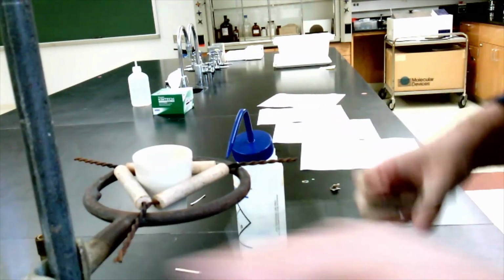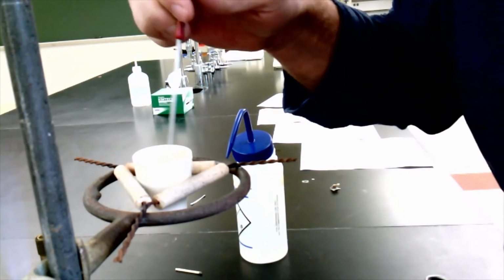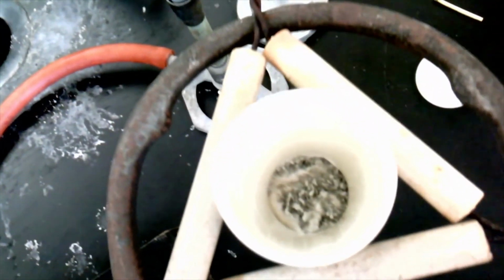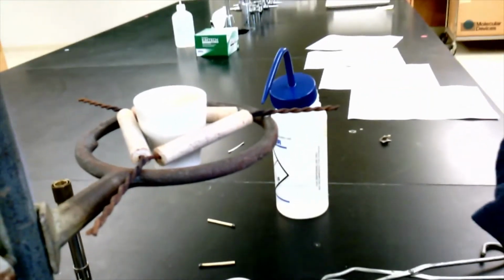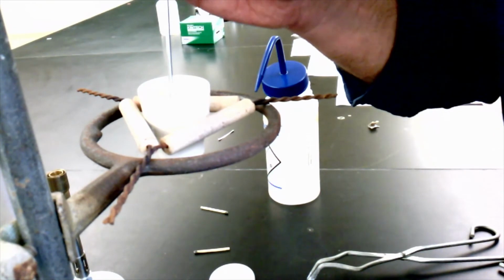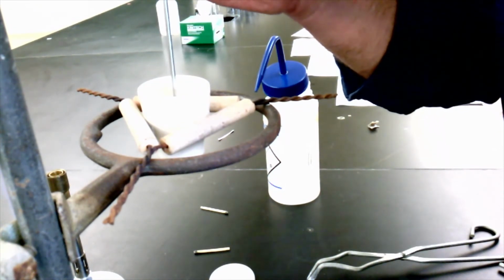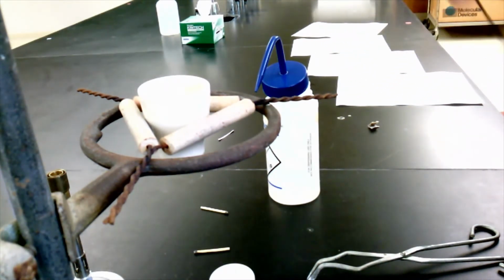Let me try to show you what the contents look like at this point so you can have an observation for that. Basically, what we got is a bunch of gray and white powder. Okay, there's no shiny metal pieces left. It's all just sort of gray and white powder. It may not be totally reacted, based on the fact that some of these pieces of gray are pretty dark. May indicate that there's still some magnesium metal in here, but that's okay. We just kind of want to collect some data and work it up and see what we get.